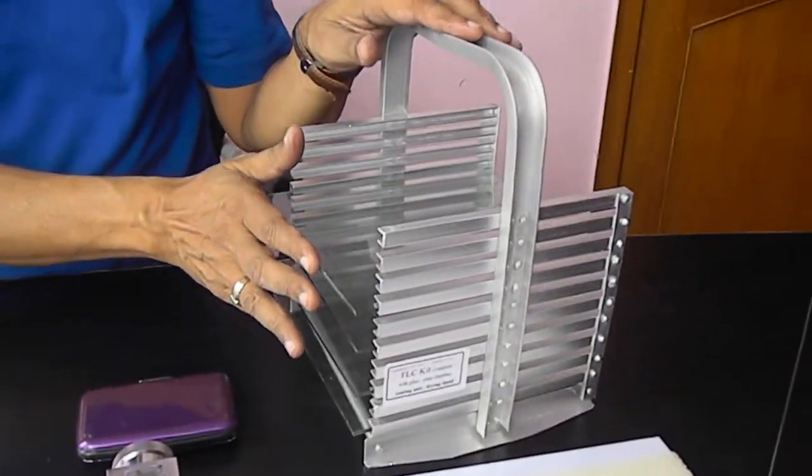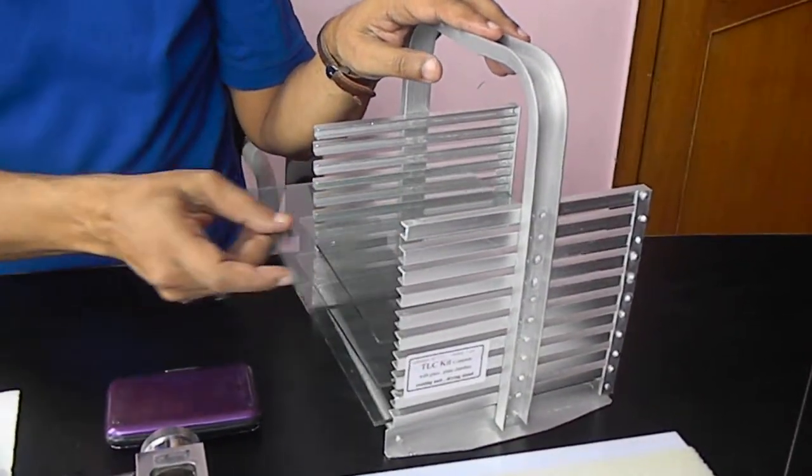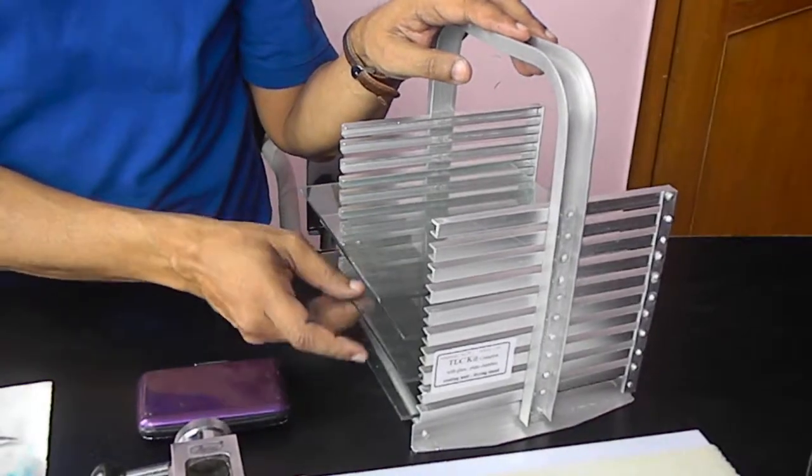You can dry in air or you can dry in oven. Aluminium, there are many plates. We have provided the glass plates.